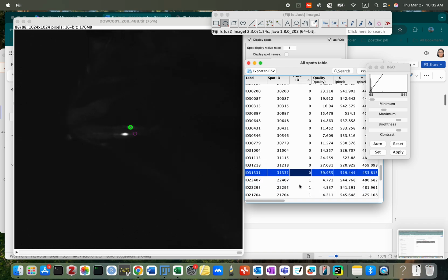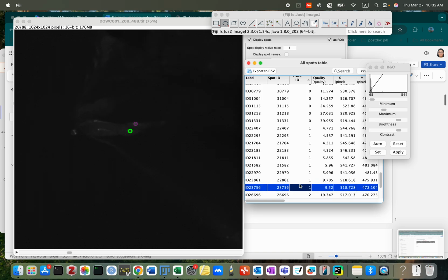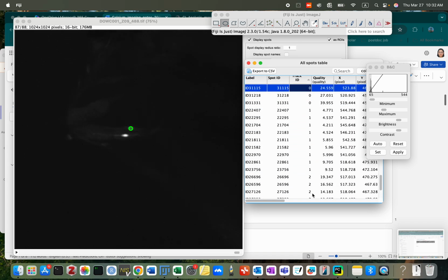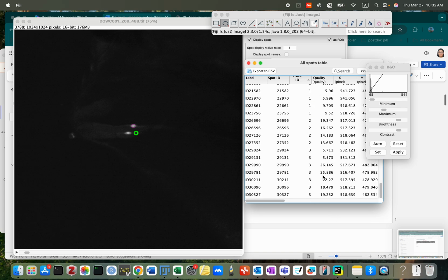Start from checking ID 1. That is wrong. Okay, and then we have neuron 1 selected. This is also wrong because we are working on neuron 0 and also 3. Okay, for this stack, it's easier. So we just delete all the checking ID with 1, 2, and 3. Come to our Excel.